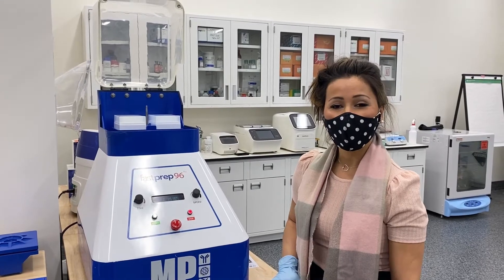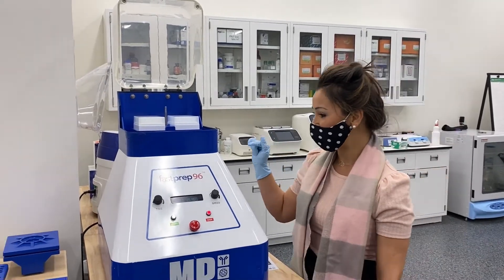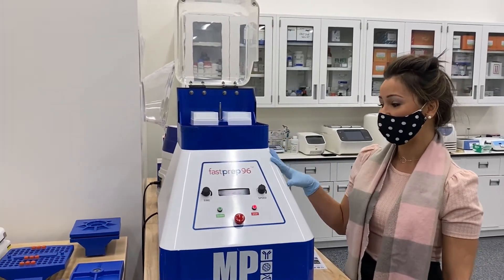Hi there, my name is Lydia. We are in the Irvine lab with MP Biomedicals. I am discussing how to turn on and how to operate the FastPrep 96.